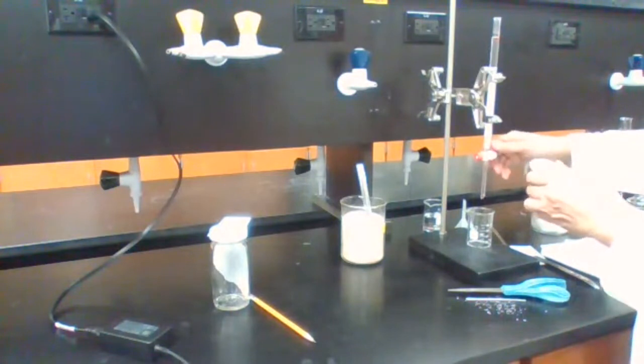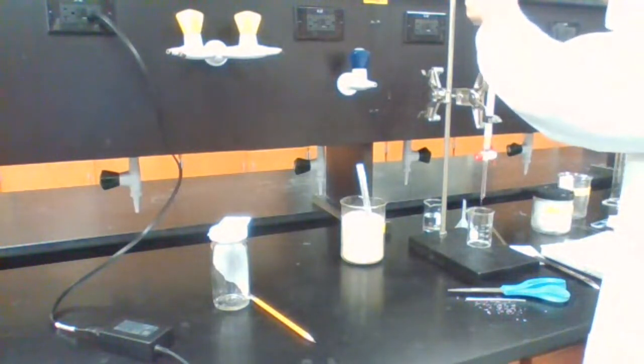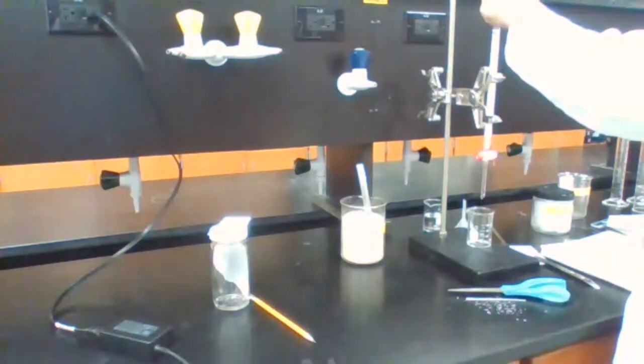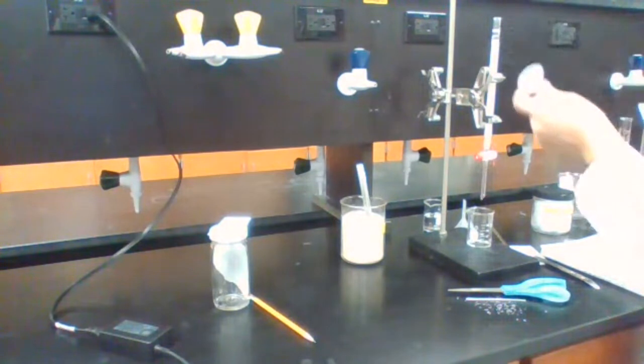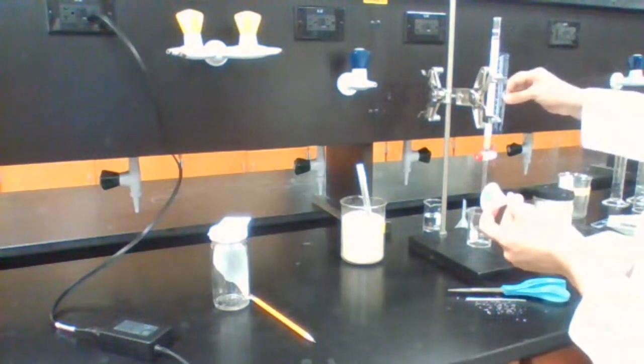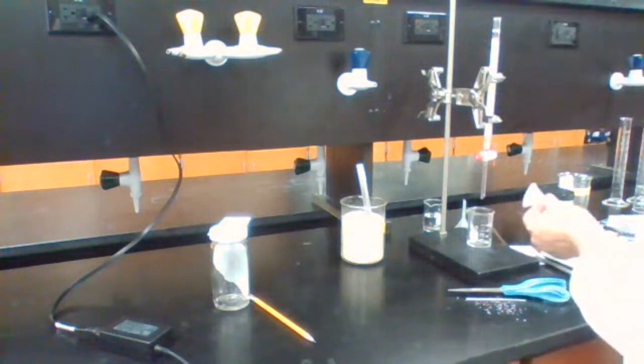I need to add more of the alumina. About 6 inches in height at least. So I'm going to stop right there. This should be enough alumina.